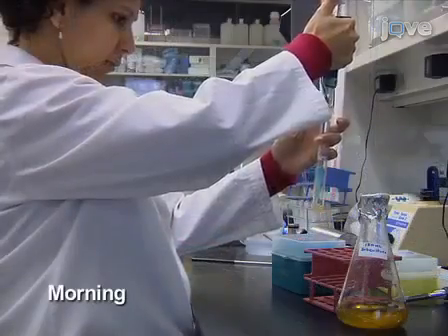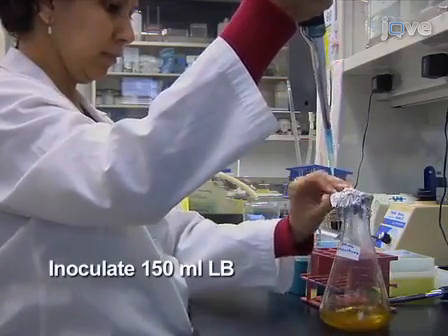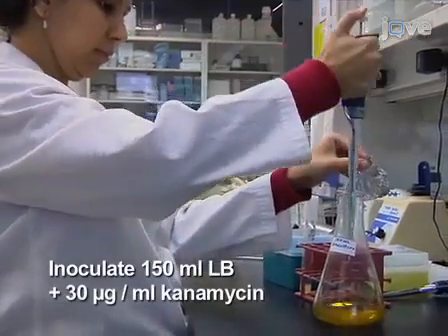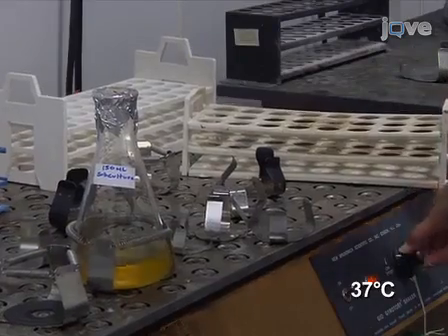In the morning, use the overnight cultures to inoculate 150ml of LB containing 30mcg per milliliter kanamycin. Grow the culture at 37 degrees Celsius on a shaker.